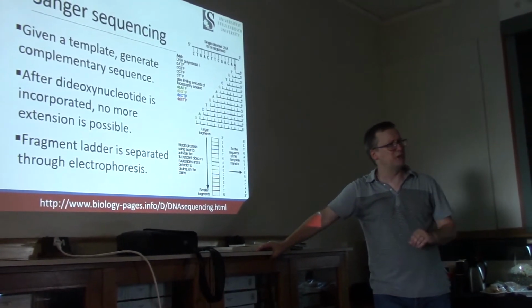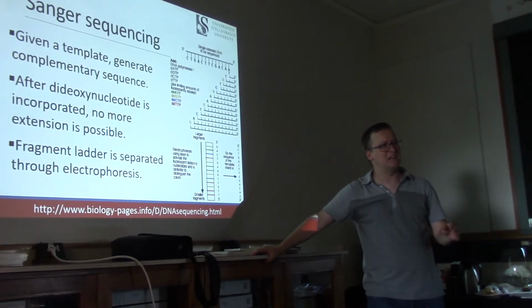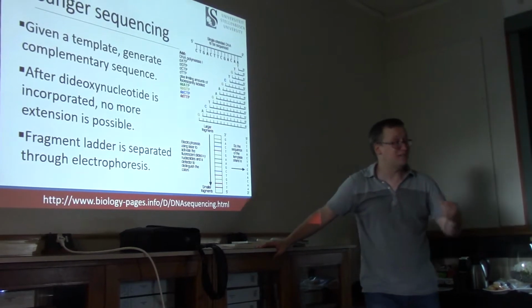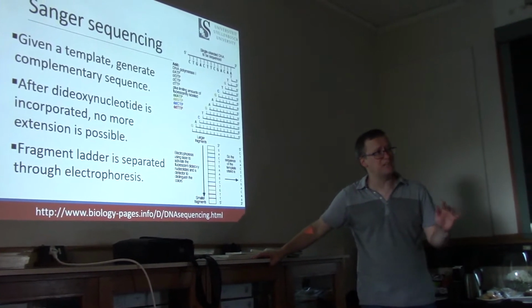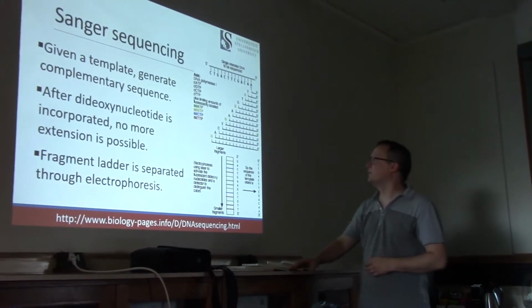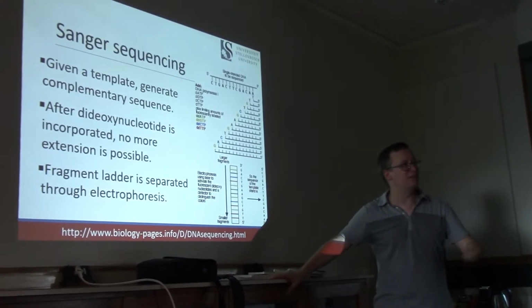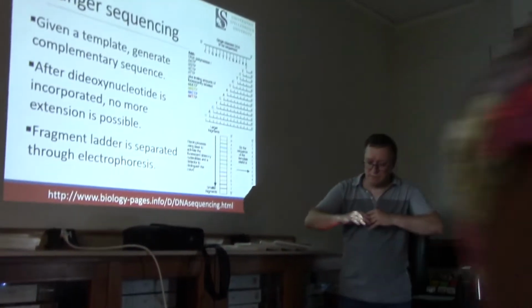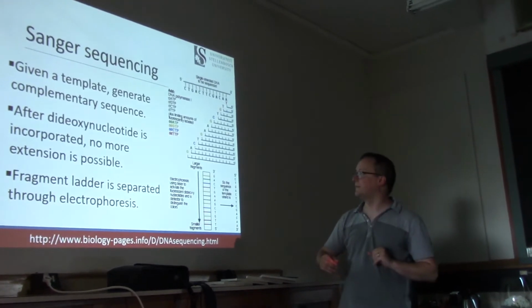Now, I imagine at this point, you picked up this material back when you were undergrads taking biochem class, but it's important, I think, to remember that it's still very much live information. I would also point out that this is a rather different mechanism than what is typically used by machines like Illumina sequencers and so on. We frequently see a strategy where we're detecting the arrival of each nucleotide by a light that's emitted by the incorporation of a new nucleotide.